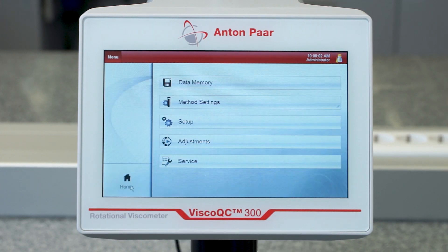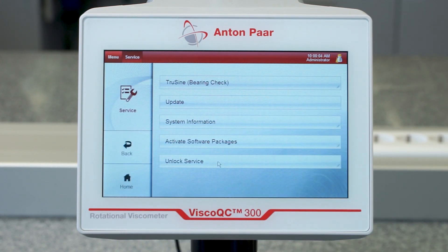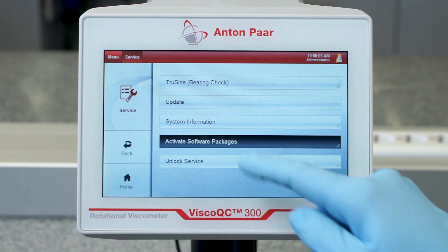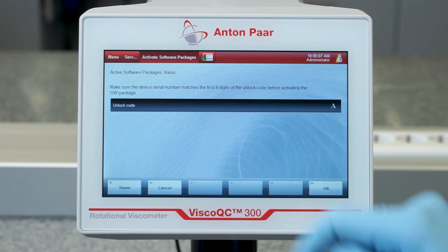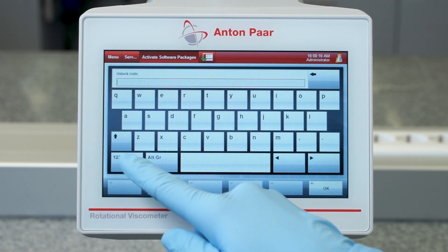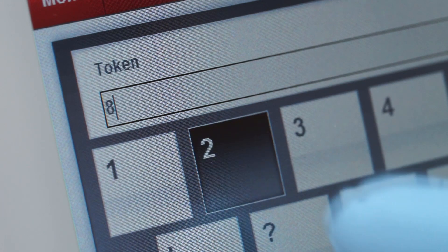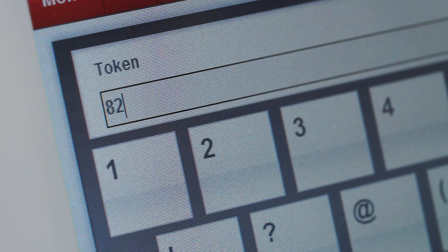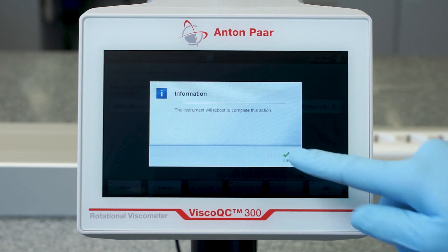By upgrading VSCO QC300 with the optional software package V-curve, features such as the online graph for live measurement data, programmability of steps, analysis with mathematical models, and the determination of the static yield point with vane spindles are added.